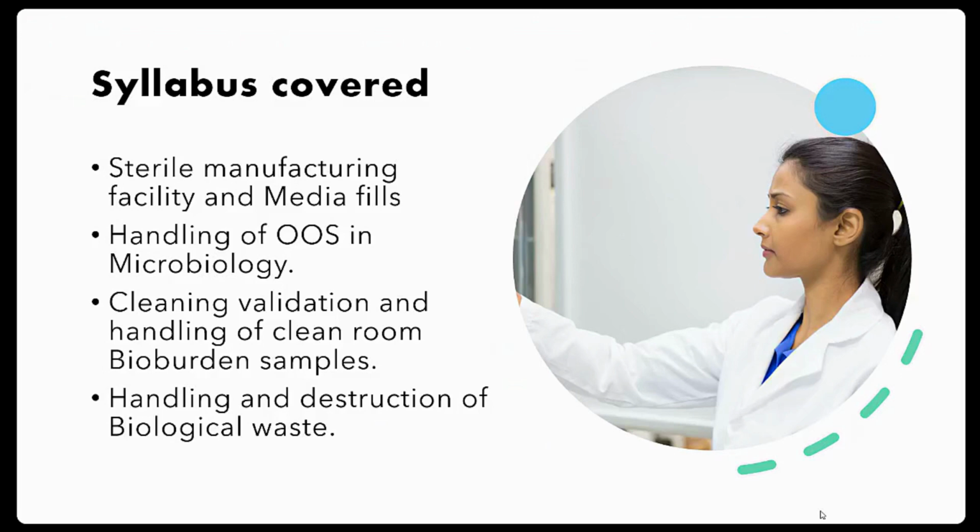Next, cleaning validation and handling of clean room bioburden samples. Cleaning validation is validating our cleaning method which is used in the manufacturing facility for all instrument surfaces. After cleaning, we'll collect the bioburden samples and we'll check the cleaning efficacy. This is by two methods, swab samples and rinse samples. In detail, we'll discuss later.